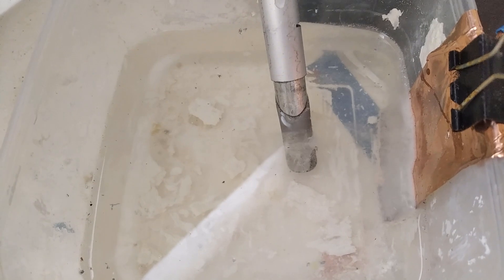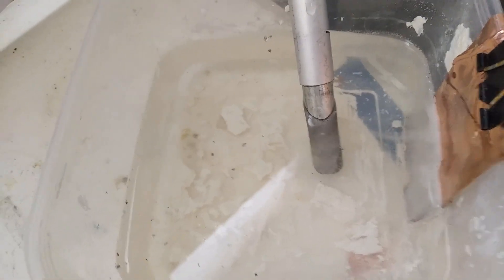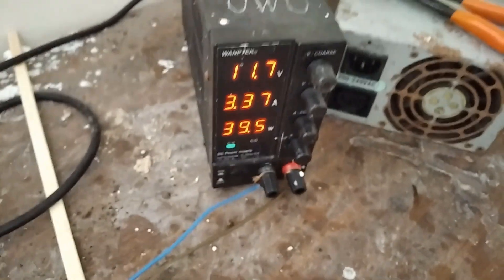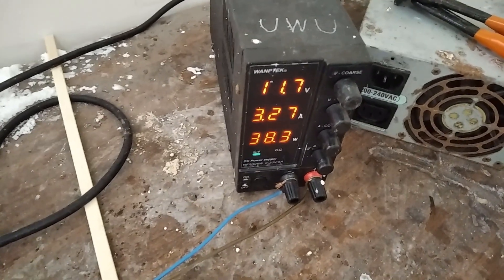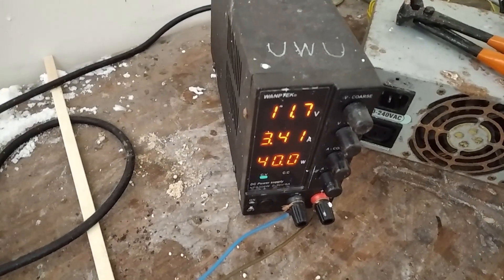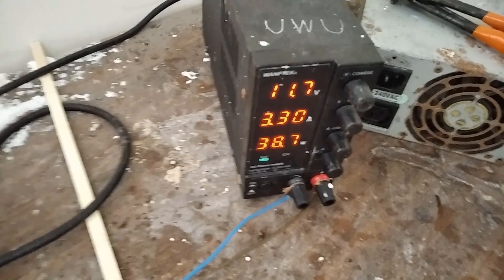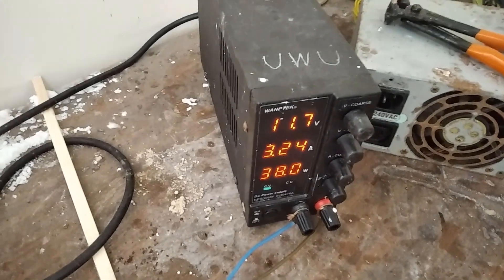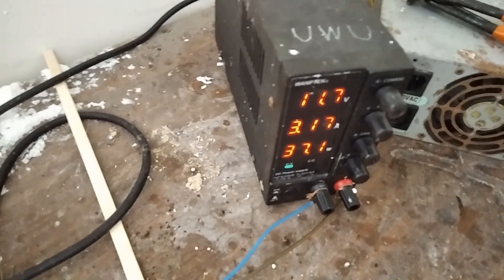It seems to go in waves — it passivates, then after a while it crumbles off, then passivates again. The current is all over the place, dropping then rising. There's a passivation reaction cycling, which is why without a membrane you're probably going to get 50% efficiency at most — basically ending up with some iron oxide and some iron metal.